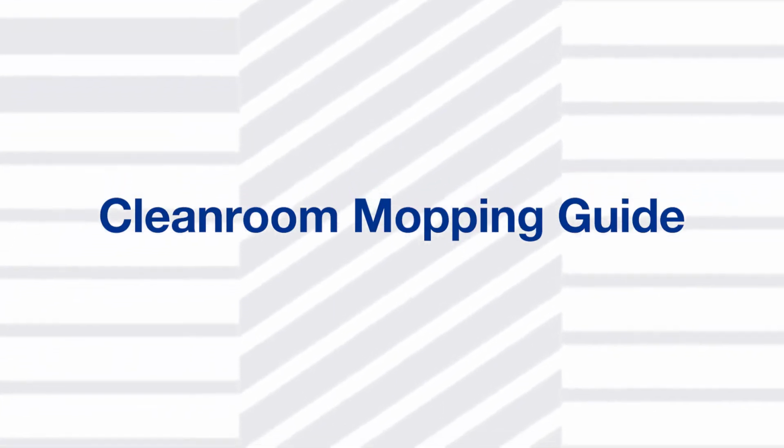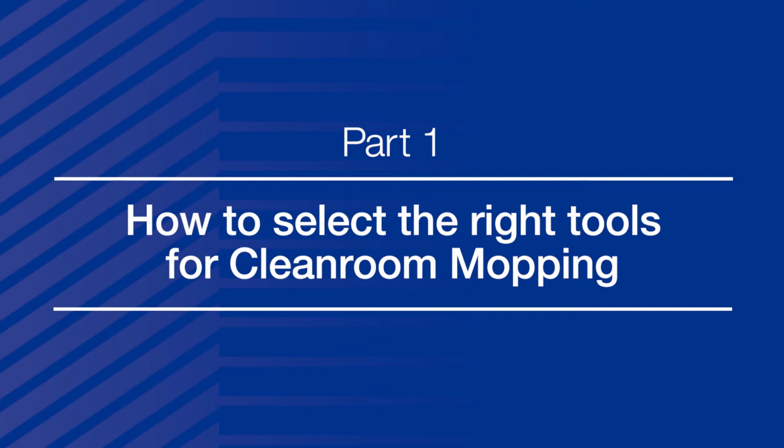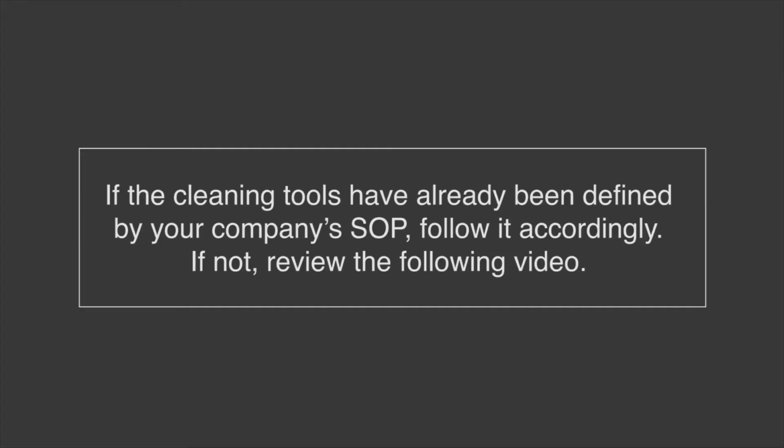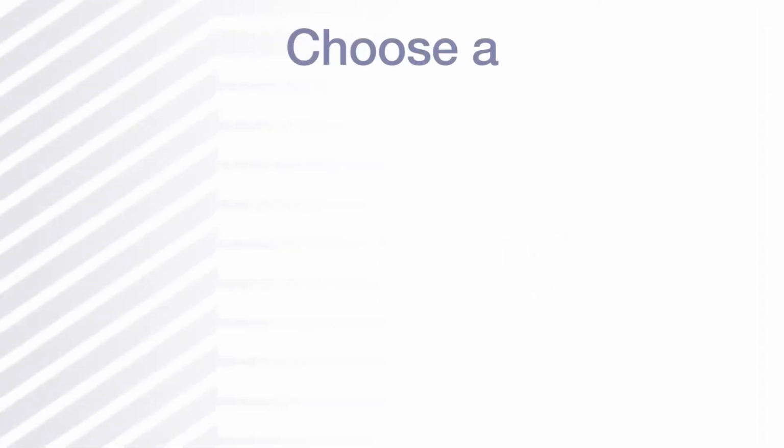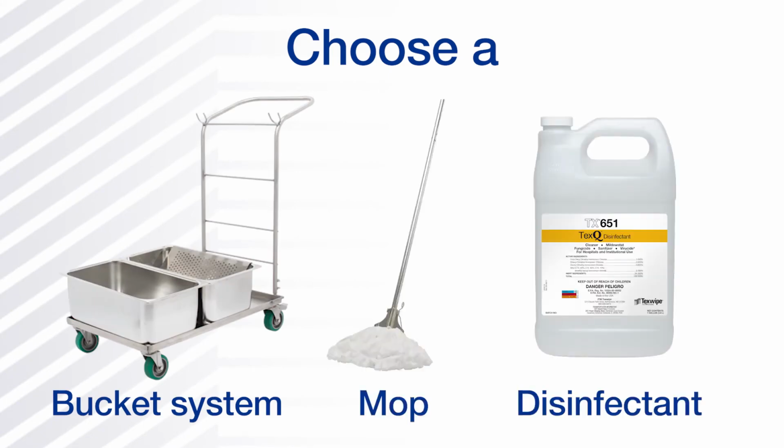Texwipe presents Cleanroom Mopping Guide Part 1, How to Select the Right Tools for Cleanroom Mopping. If the cleaning tools have already been defined by your company's SOP, follow it accordingly. If not, review the following video. Choose a bucket system, a mop, and a disinfectant.